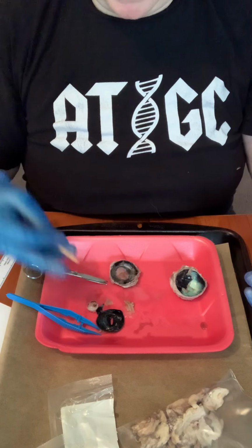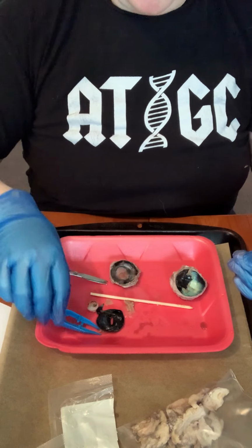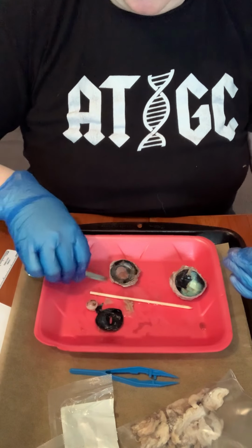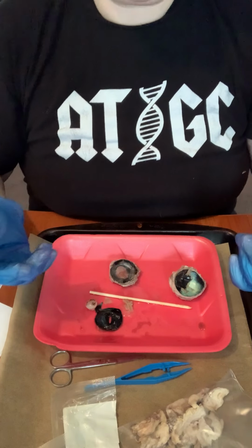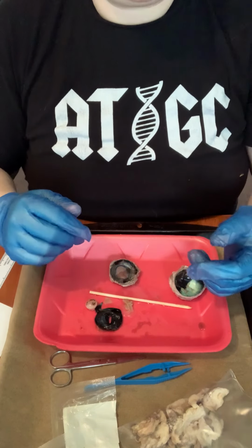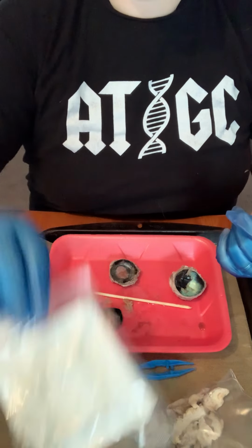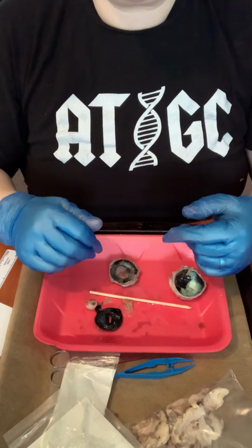Now you are ready to clean up. So I would personally toss the wooden probe, the tongs, the forceps, the scissors. Those can get wiped off, right? All of the other parts, you should put them in your bag for disposal and then throw them out. So including the bag that your eye came from. So put everything in that disposable bag.